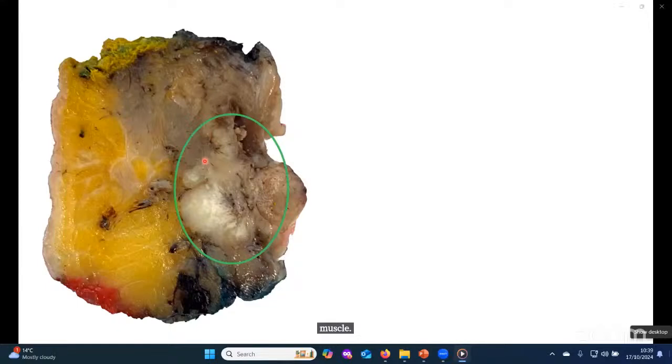The carcinoma has infiltrated through the buccinator into adipose tissue. This area is of particular interest. This represents a blood vessel, and this pale grey to translucent material is suspicious for tumour.